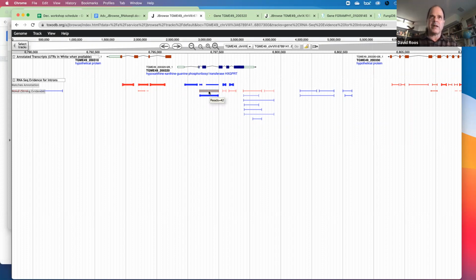And when I say a little bit, I mean a very little bit, only 42 reads compared to nearly 1,000 times as many. And similarly here, roughly 1% of this total. This is common, that some number of reads in these strand-specific RNA sequencing experiments were mapped to the wrong strand, and so we can probably ignore those changes.